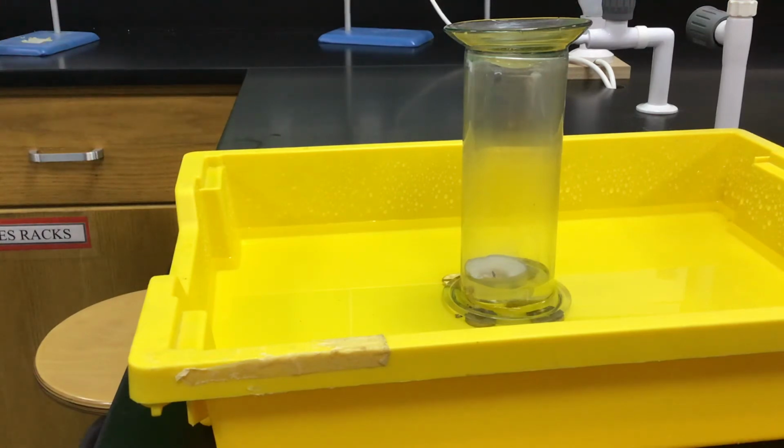Now this cylinder is not particularly useful in terms of the lack of measurements, and the way that I put the lid on, etc. wasn't the best. But what we've seen is that the water level has gone up, and we should have seen it go up about 1/5 of the tube. It's still creeping up a little bit right now. Yeah, it is creeping. I don't think you can see it in the video, but I can see it.